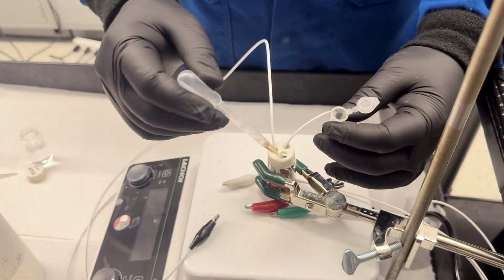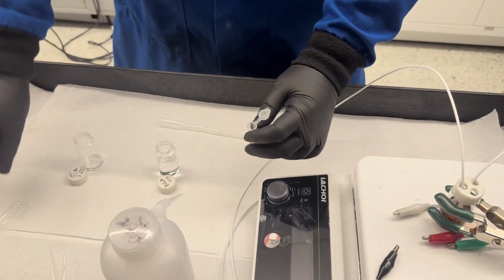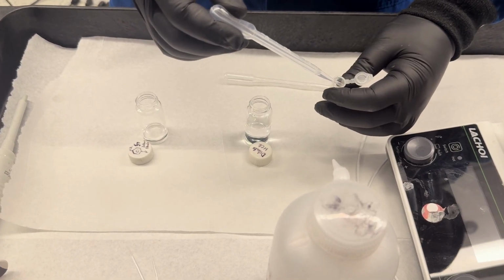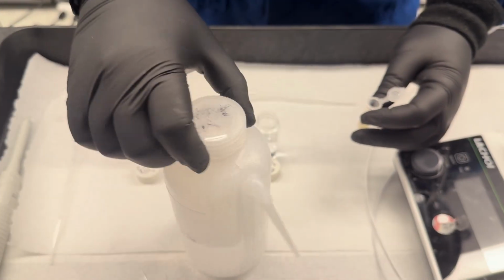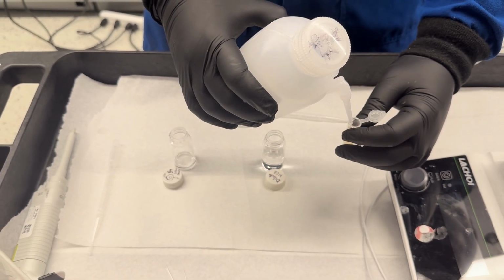As it is a highly basic solution, we first need to use dilute HCl to neutralize it. We added 0.5 ml of dilute HCl, and you can see the color change as it gets neutralized. Then we add 1 ml of ethyl acetate to the reaction mixture so that we can do the workup.